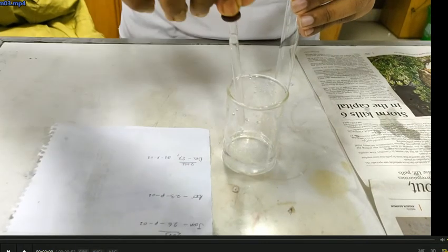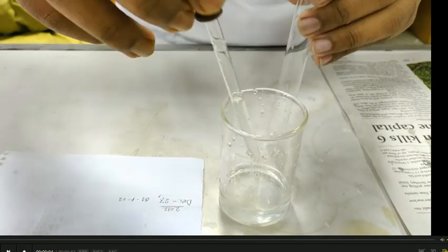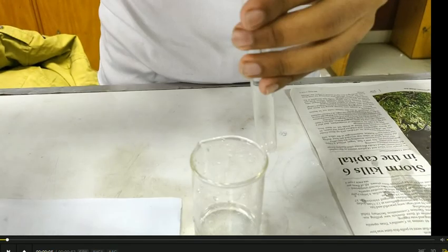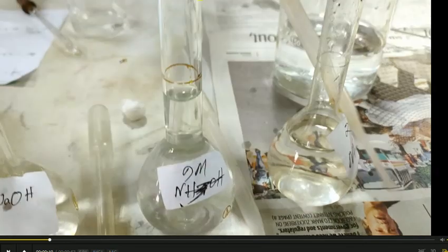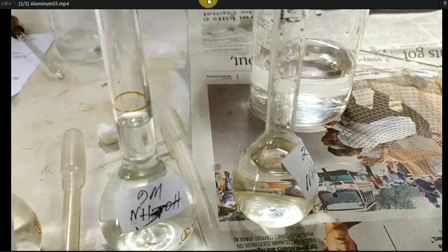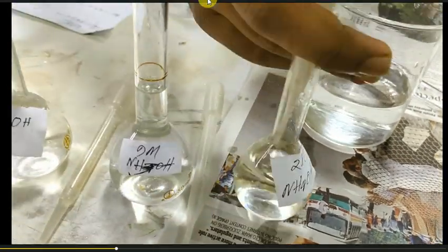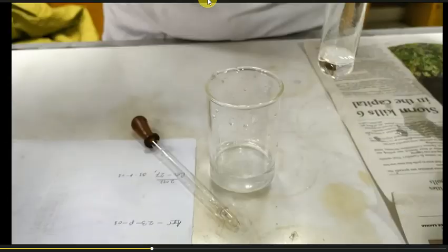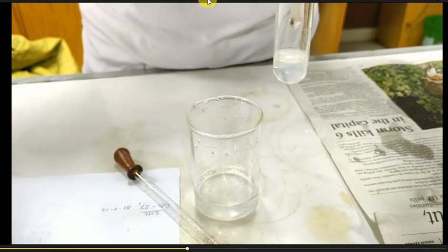For the confirmatory test for the presence of aluminum ion, 1 ml of sample solution has been taken in the test tube. Into this sample solution we are going to add a few drops of 2M dilute ammonium hydroxide. This will produce white precipitate, and the precipitate will not dissolve upon the addition of excess ammonium hydroxide.